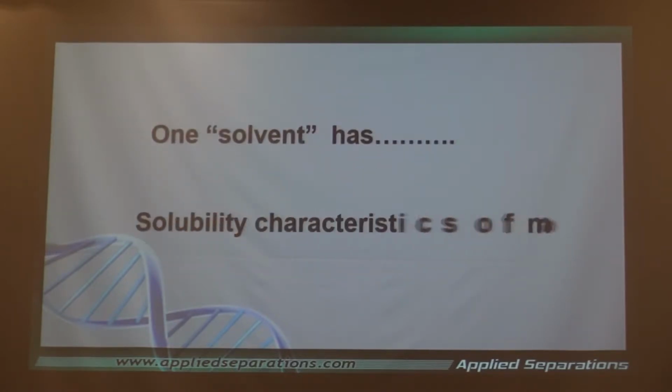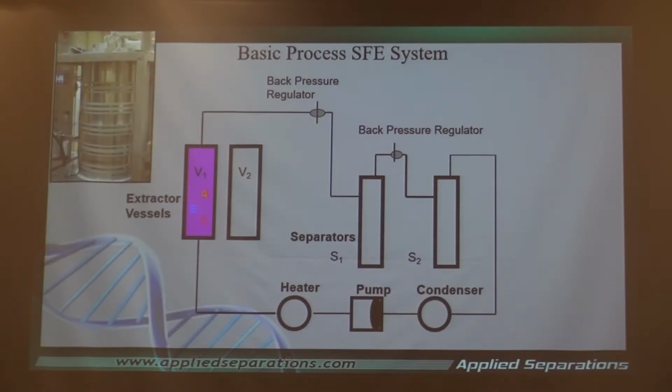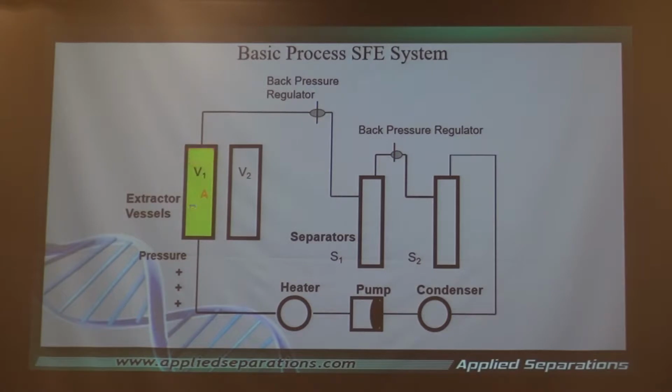So from one solvent, we have the solubility characteristics of many. This is a very powerful tool that you have in doing these kinds of separations. Let's use the practical example, as this is the system that is at MAPAPCA. Let's say we have compounds A, B, and C in a pressure vessel. We start up the pump, we bring it to a high pressure.